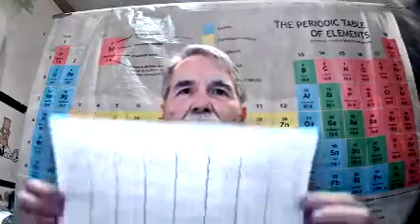For this experiment, you're going to want to set up a data table for recording your observations. And you want the table to look like that once you've got it set up. Across the top of the table, you want to list the solutions you are working with. In the first row underneath them, you want to observe what they look like.